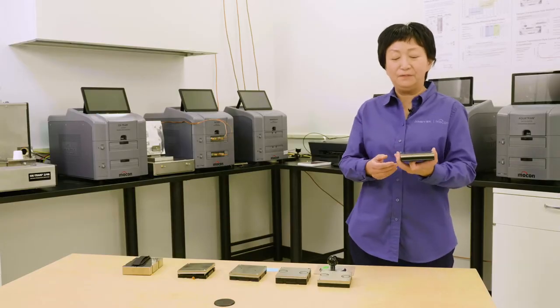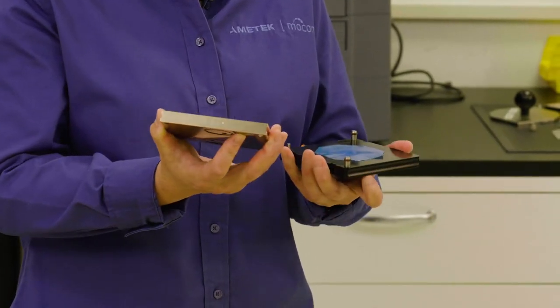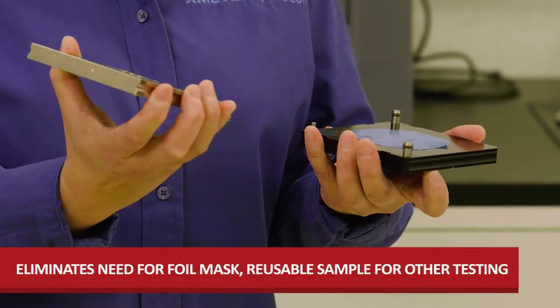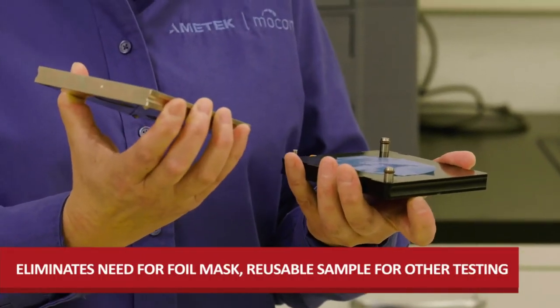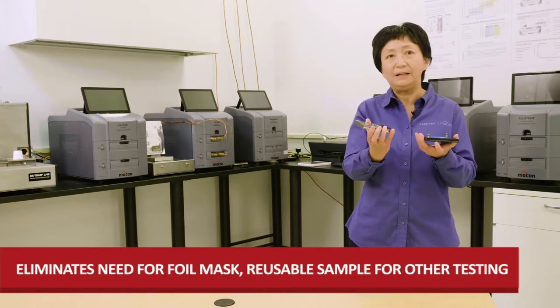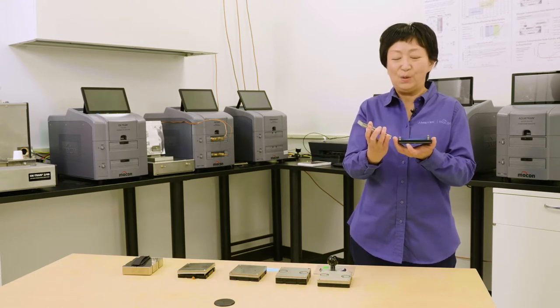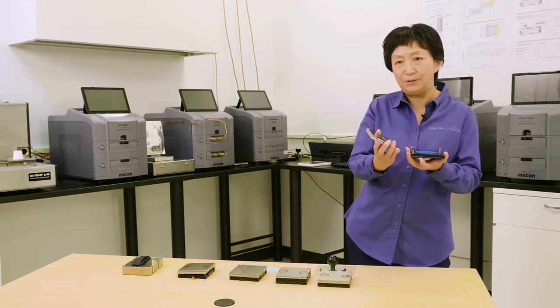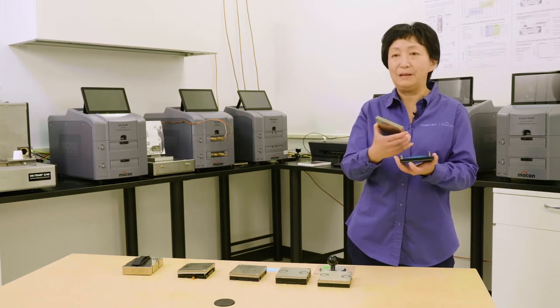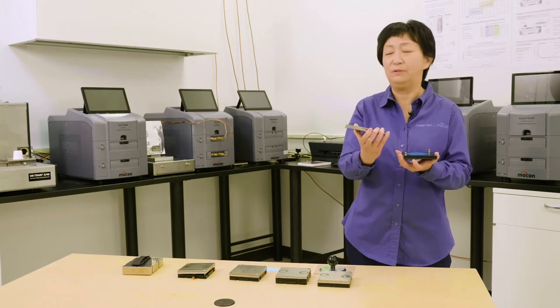Another benefit of this cartridge is that a lot of polymer films are not compatible with an aluminum foil type of mask because you have to use adhesive on the back of the mask. In this case, we don't need any adhesives, so you don't have to worry about compatibility issues. Plus, your sample won't get stuck to the adhesive, meaning this piece can be reusable for other testing.